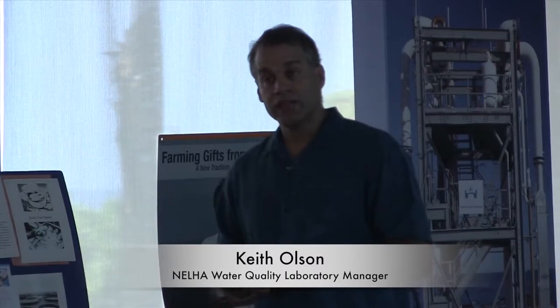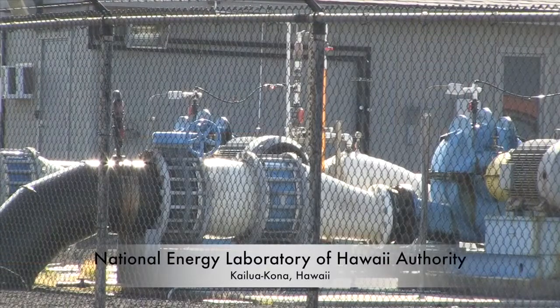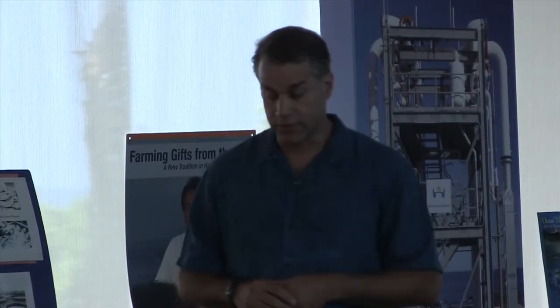We've been testing here for about 32 years. Environmental sampling, 32 years. And this is a really broad sampling schedule that we have. We test all kinds of water chemistry stuff. And we also do independent biota and benthic surveys on an annual basis.